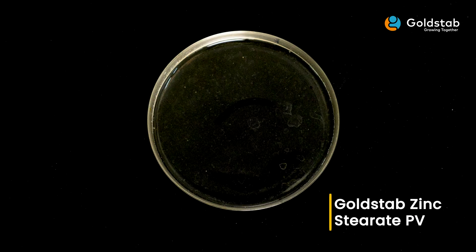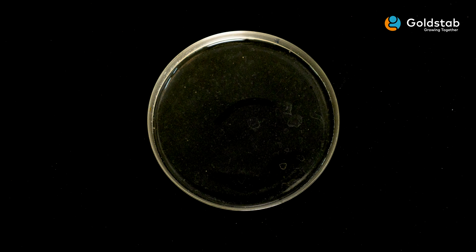Check if it is transparent. This sample is of Gold Step zinc stearate PV grade, which is showing very good transparency and free-flowing nature. This indicates the high quality of the product, which translates into superior performance in terms of lubrication and flow properties.